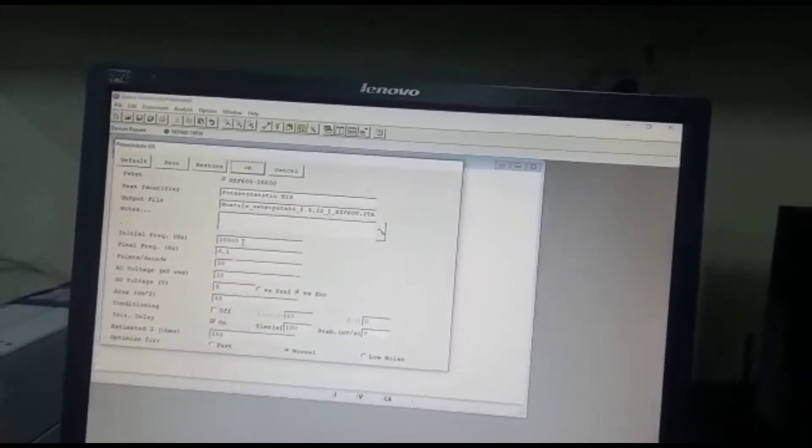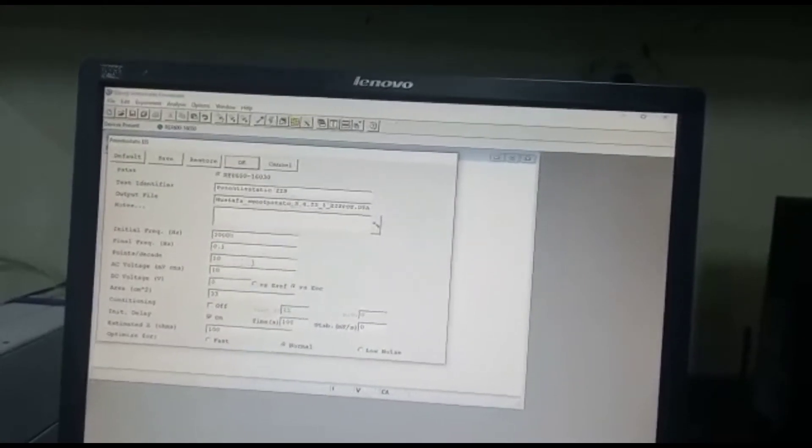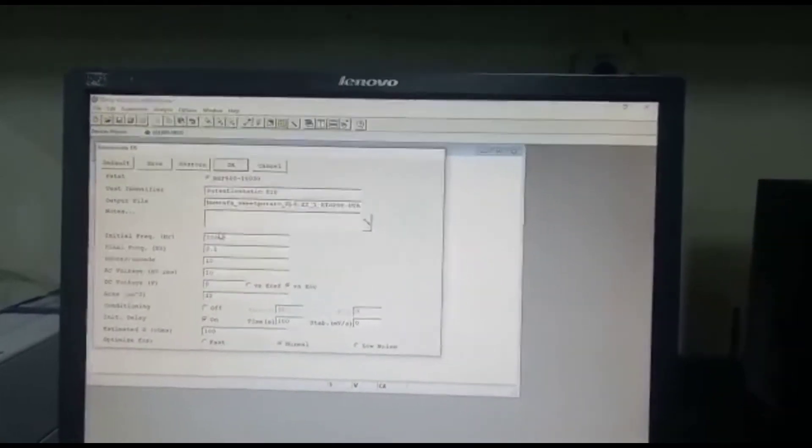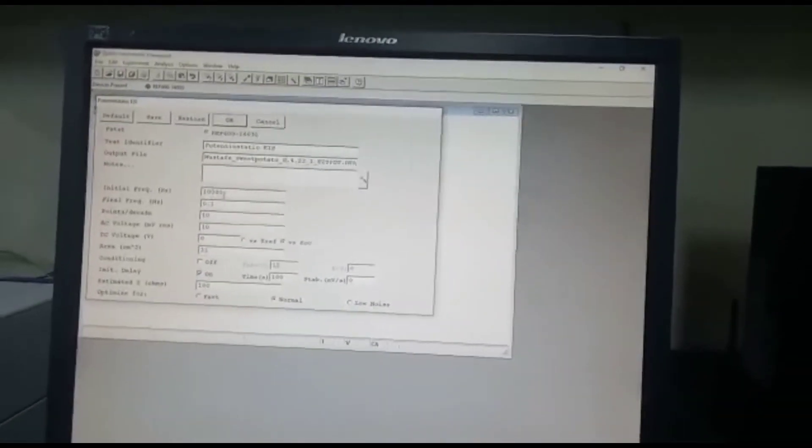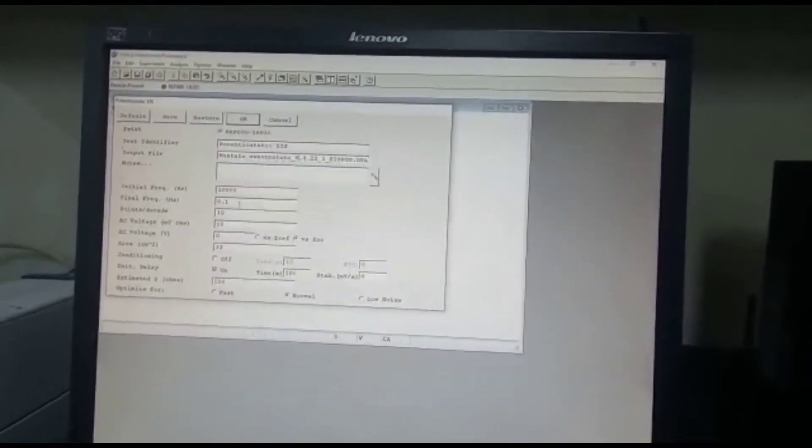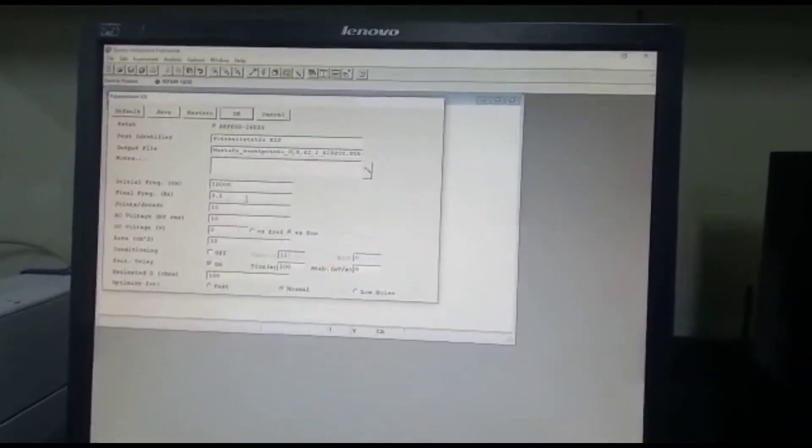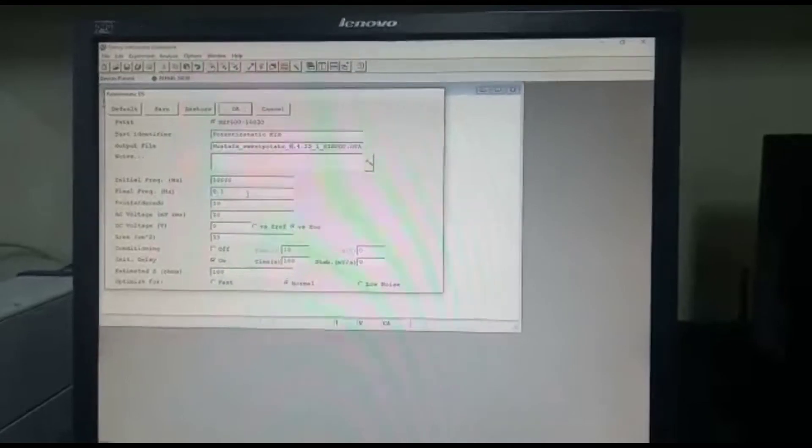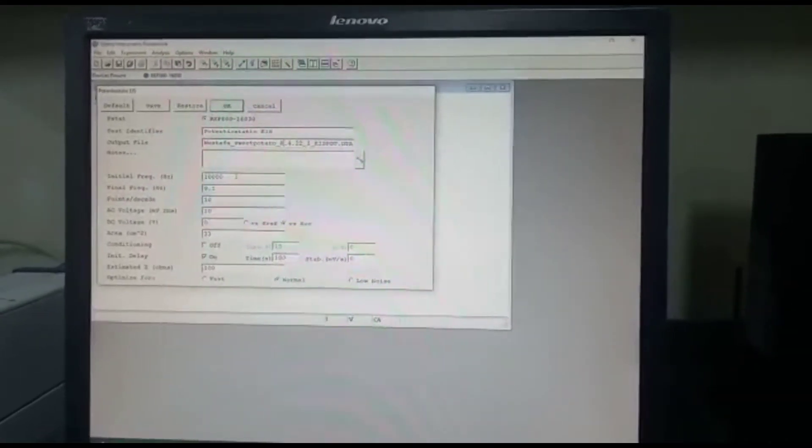And then the range of frequency is also important. Over here we are doing it from 10,000 Hertz to 0.1 Hertz. So this is actually a very good range in order to run microbial fuel cell. You can actually go even higher.